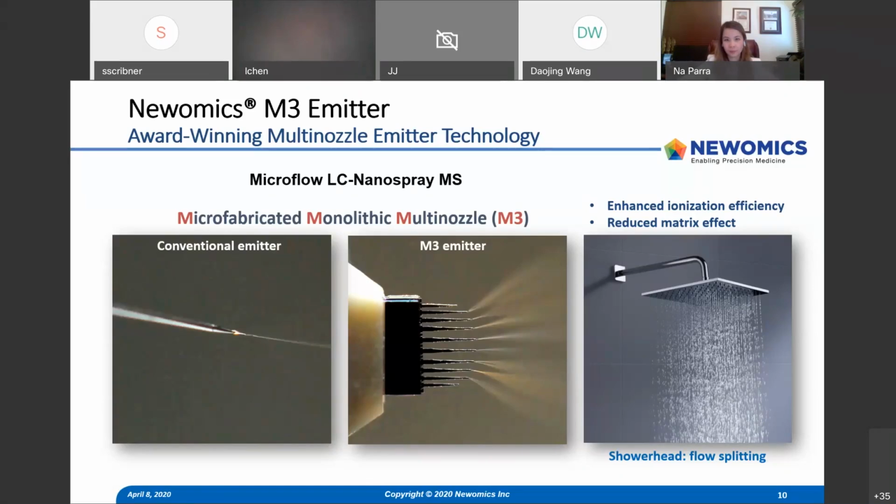So our criteria is 300 runs, typically lasting 4 to 5 days, depending on your LC-MS gradient. Some people run a 20 minute gradient, some people run 1 hour, but for microflow, we don't suggest you run a really long gradient. That defeats the throughput. So for those kinds of samples, I would say 300 runs with a 4 day lifetime.